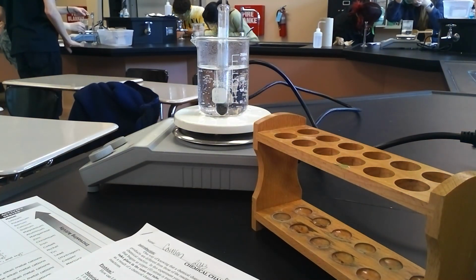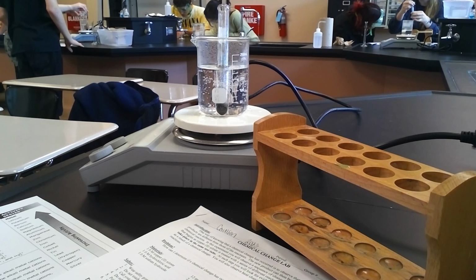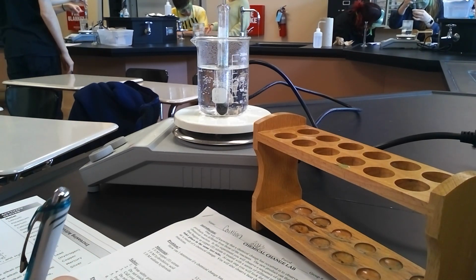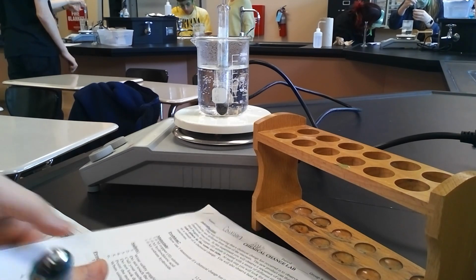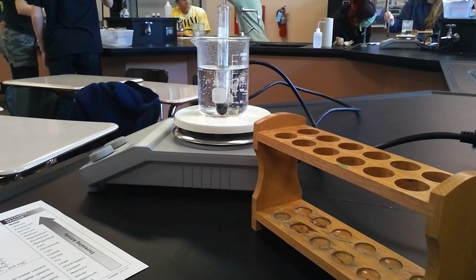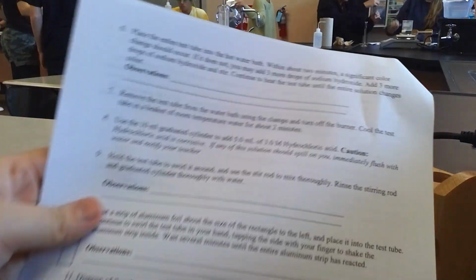And then it says touch the bottom of the test tube. I forgot to do that part, but I did not notice a temperature change, so I'm going to go ahead and write none noted. So touch the bottom of the test tube, none noted for that one. Then on to the next page. So we are already at number 6.